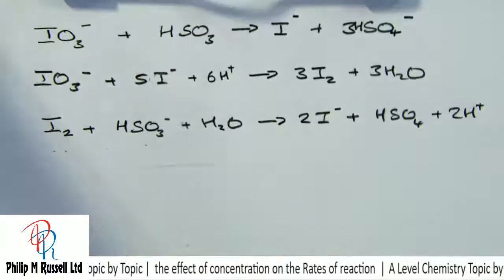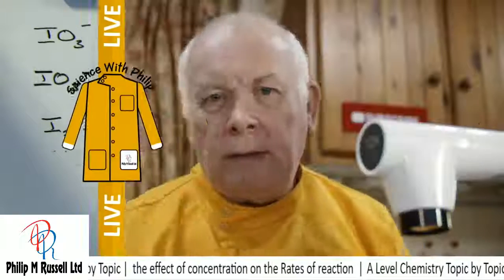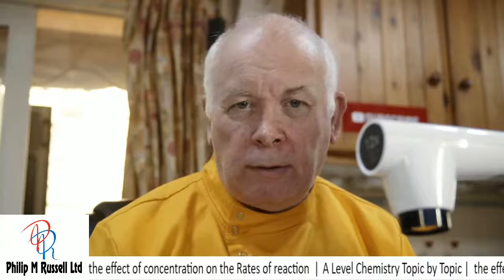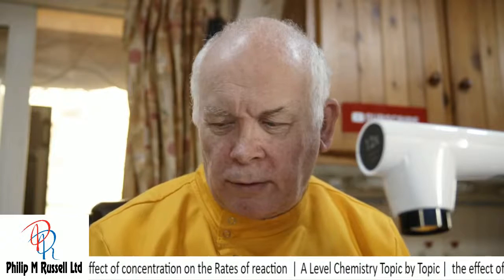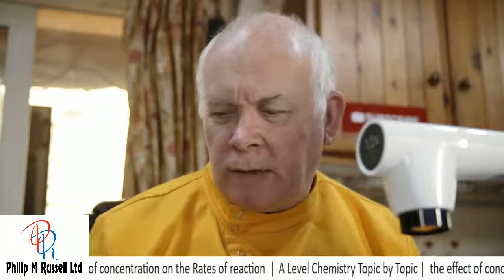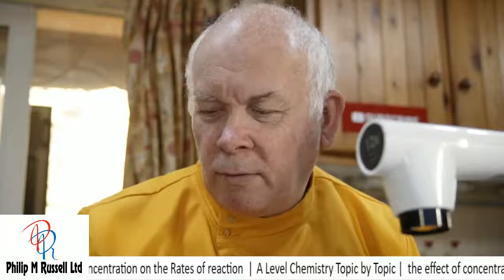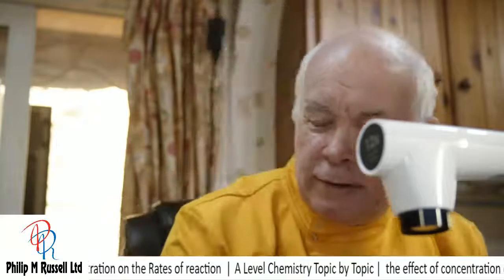So this reaction is quite a useful one, so that we can investigate the effect of concentration on the rate of a reaction. Now the rate is here going to be proportional really to 1 over t.